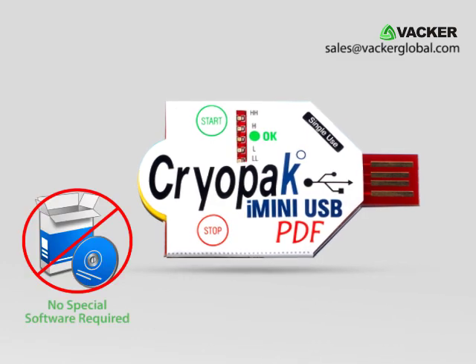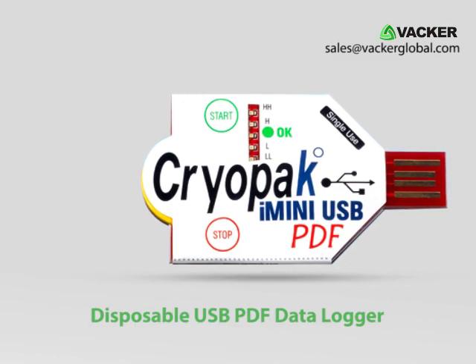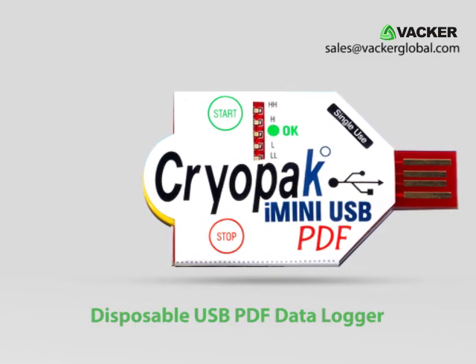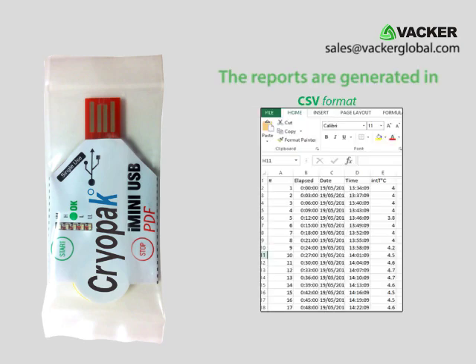It doesn't need any special software and generates the reports automatically like a USB flash memory. This disposable USB PDF data logger can generate automatic reports in PDF, Excel and text formats.